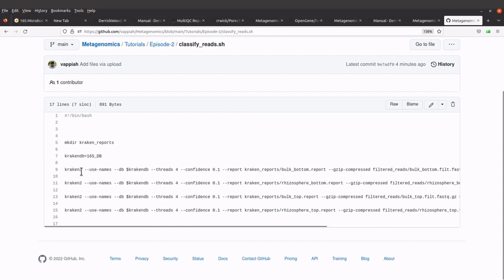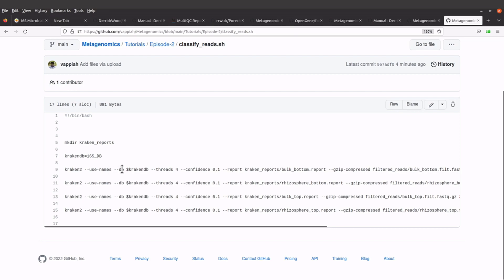I have kraken2. I also have use-names, which is an option that we use to specify scientific names, and we also have the db, which is here, used to specify the database.